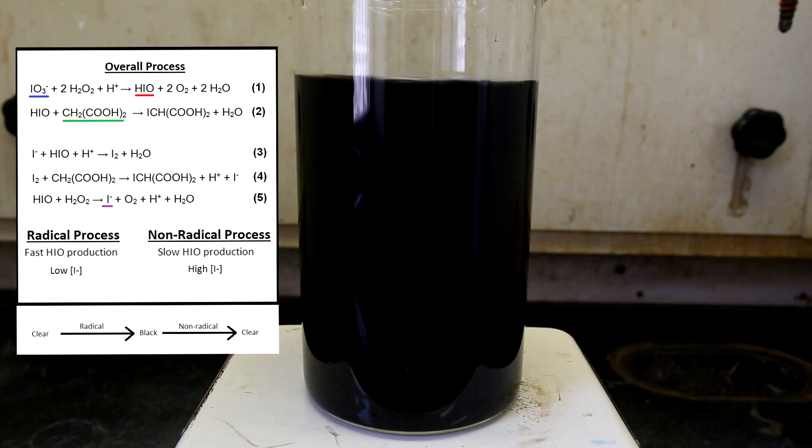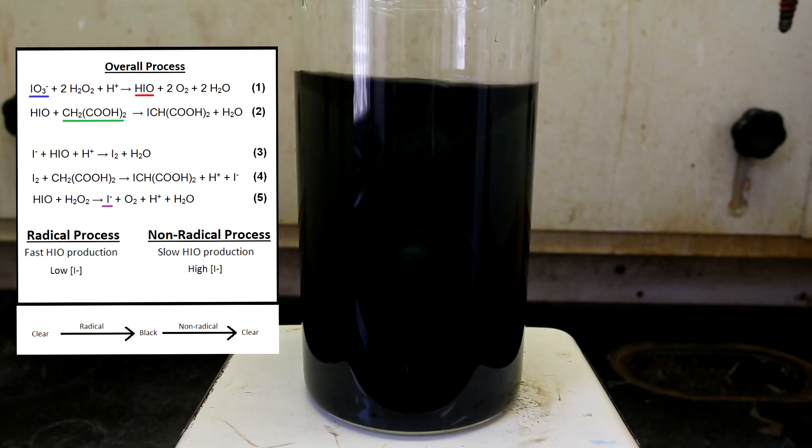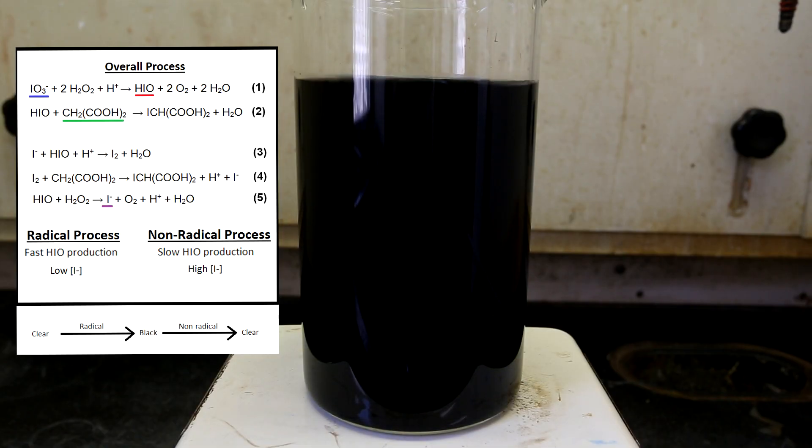Eventually, a threshold concentration of iodide will be reached. At this point, iodine and iodide molecules will combine together with starch to form a complex. The formation of the blue-black starch complex marks the end of the first half of the cycle and the end of the radical process.